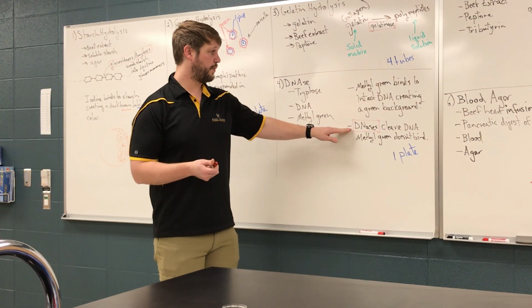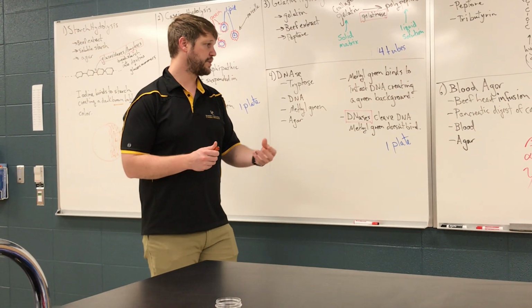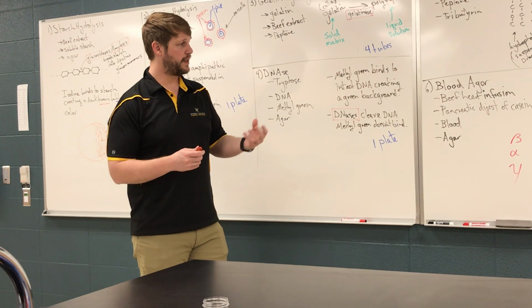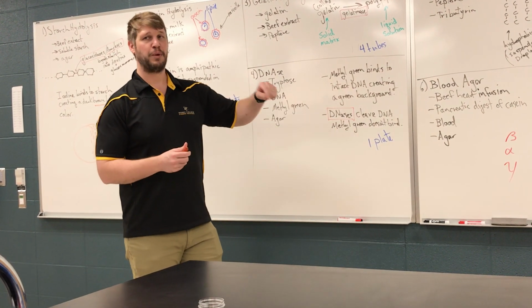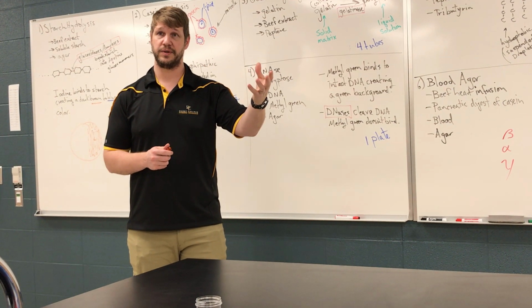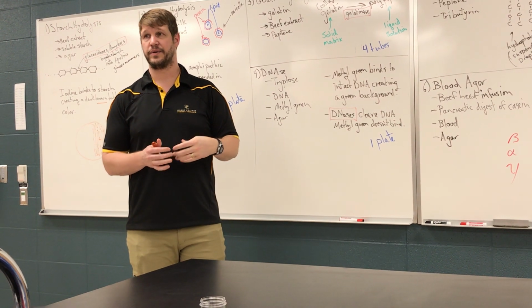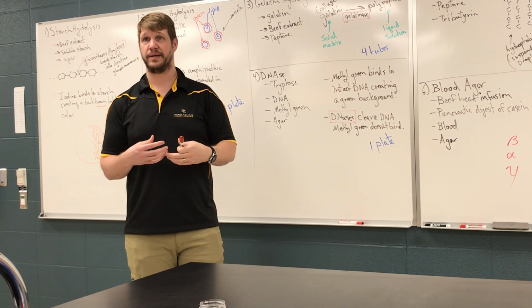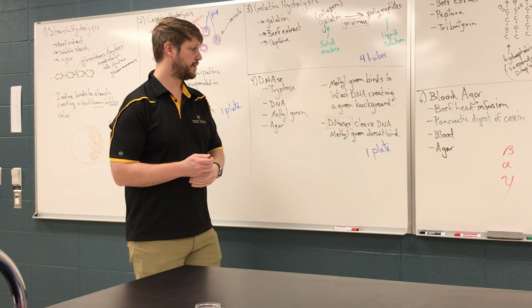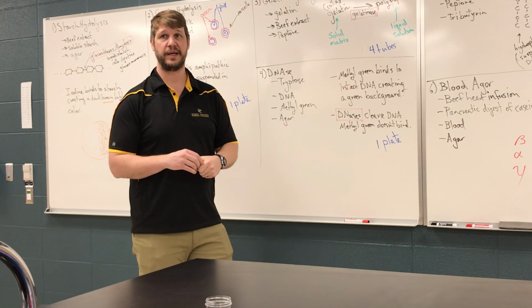So we're testing for DNases, a particular enzyme, a cluster of enzymes capable of cleaving DNA. And in reality, most organisms have these, but most organisms don't necessarily secrete them into solution. Internally, a lot of organisms have DNases that are responsible for recycling their own DNA. But they don't necessarily have the equipment to degrade DNA in their environment.